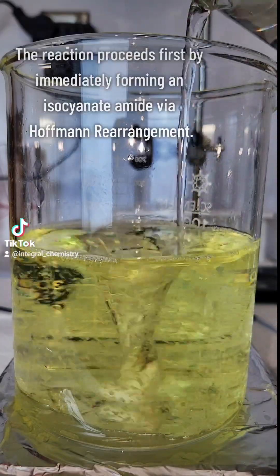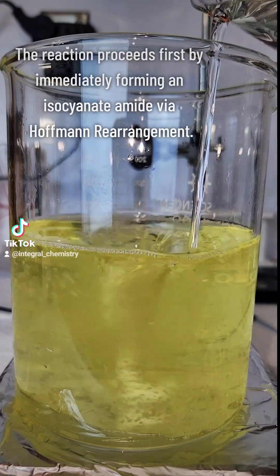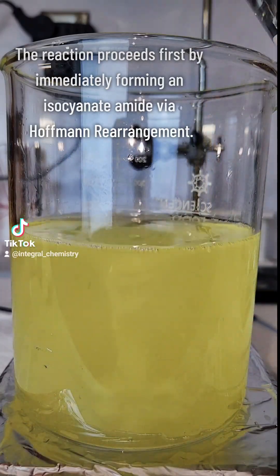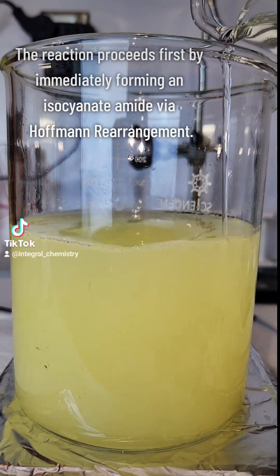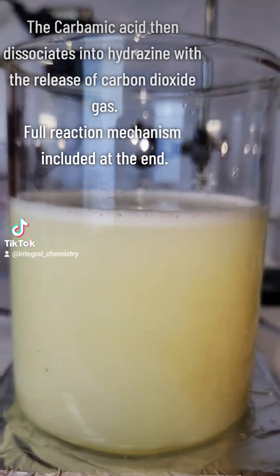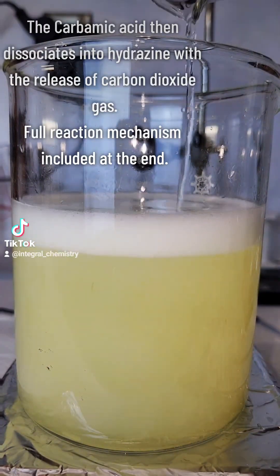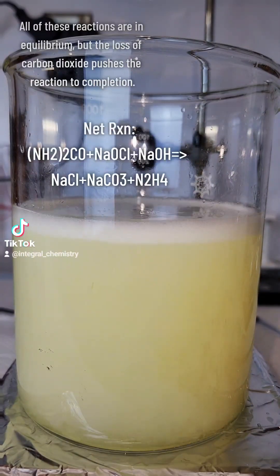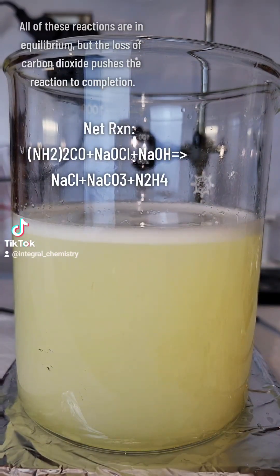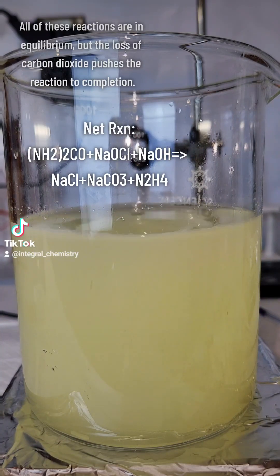This is put on high stirring, and I then add my urea solution to the bleach. The bleach and hydroxide immediately catalyze a Hofmann rearrangement of the urea to an isocyanate intermediate, which immediately reacts with water to form carbamic acid, which is neutralized by excess hydroxide to form carbon dioxide gas and hydrazine. Every step of this reaction is technically reversible, but CO2 is either sequestered by excess sodium or bubbles out of solution, which pushes the reaction to completion.